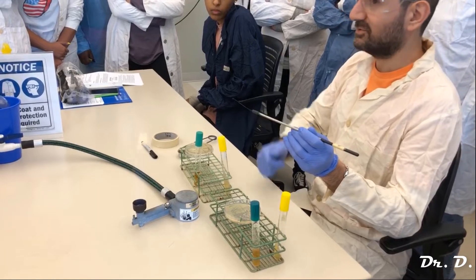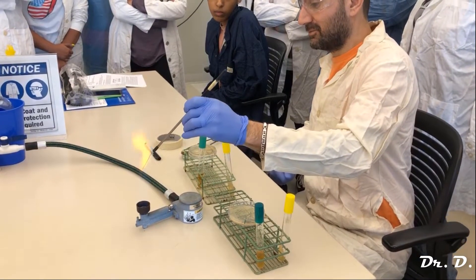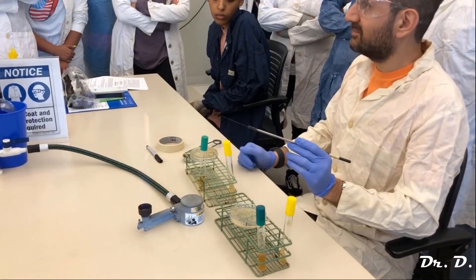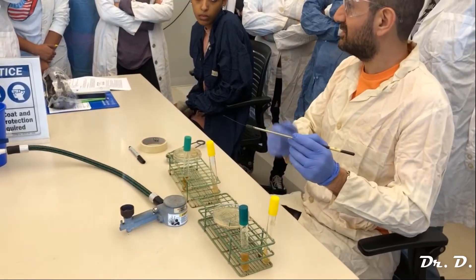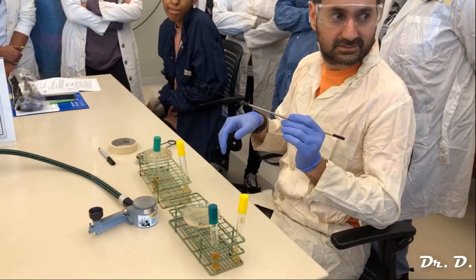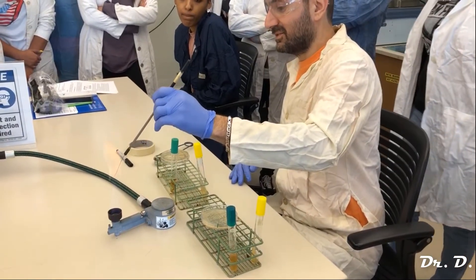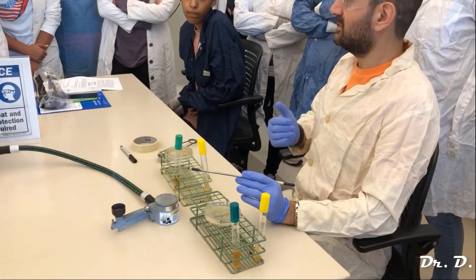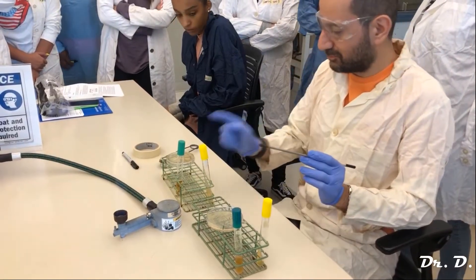Do I just throw my loop back? No — because there are thousands upon thousands of E. coli on this loop right now. If I just put it back, I'm contaminating everything. So the first thing you do is flame, and the last thing you do is flame, every single time. If my loop hits anything at all — even my glove for a second — I have to flame it again. As medical professionals, you need to know this: something ceases to be sterile once it has been out in the air too long, or once it has touched something.